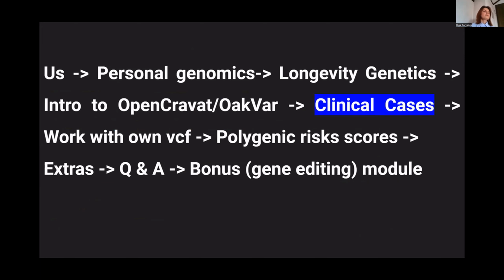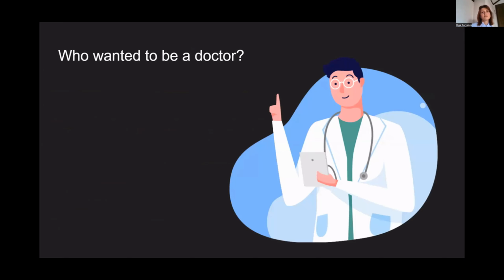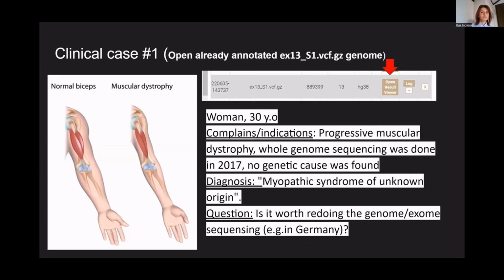So we will now move to the clinical cases analysis. They are real, long clinical cases, and you will try to find a solution for one or another phenotype related to disorders. Clinical case number 1. You can see it's pre-downloaded.